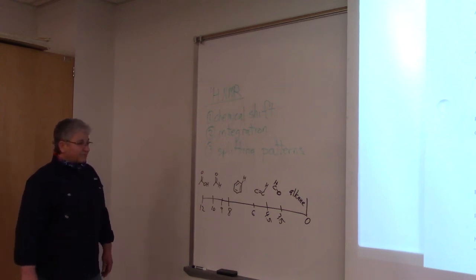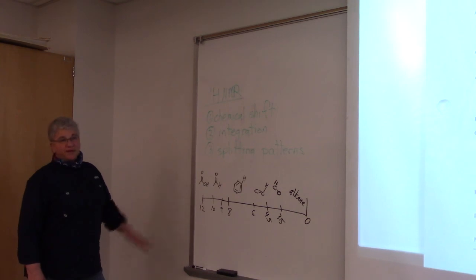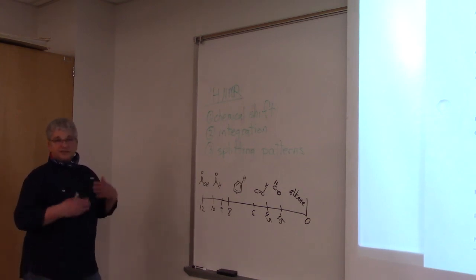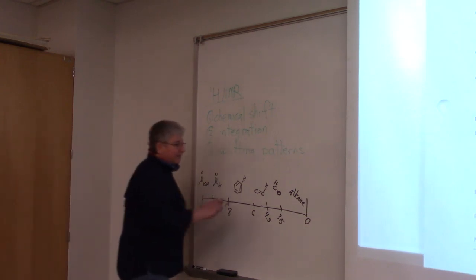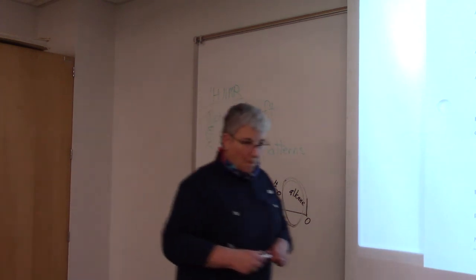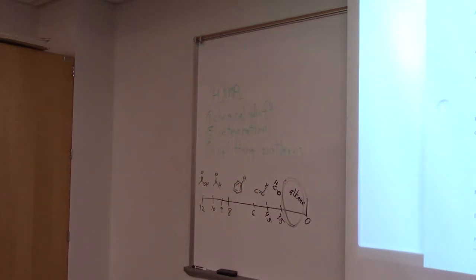Okay. So they're not nearly as many, or they don't seem to be, in my mind, nearly as many chemical shifts to remember because lots of things really overlap in that region. All right, so that is the discussion of chemical shift. Before we move into the idea of integration, why don't you pause the video and take a 2-minute break.